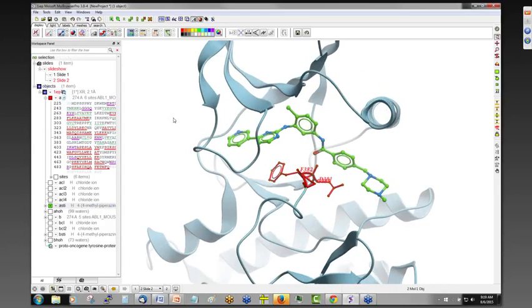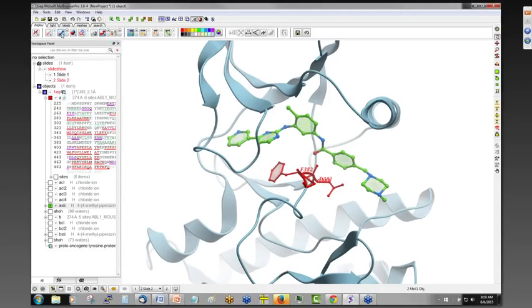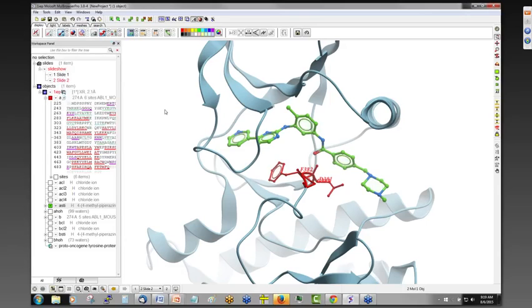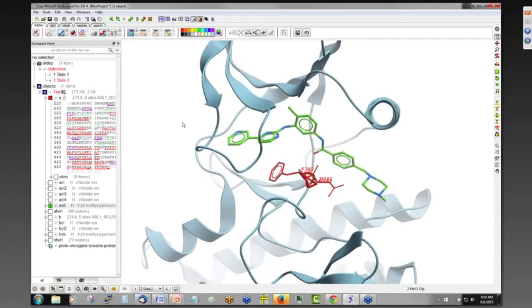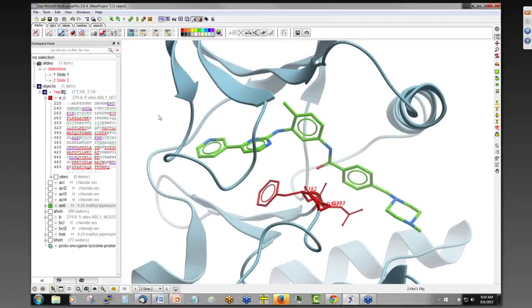and other things like that. So if you click and hold, you get a variety of different options. You can change things like thickness and other options, the style of the chemistry representation. So let me return that back. So you could maybe remove these, the ends. The ratio of the ball and stick will be 1, so it's nice and flat. But it's up to you. You can save these preferences to how you like it.